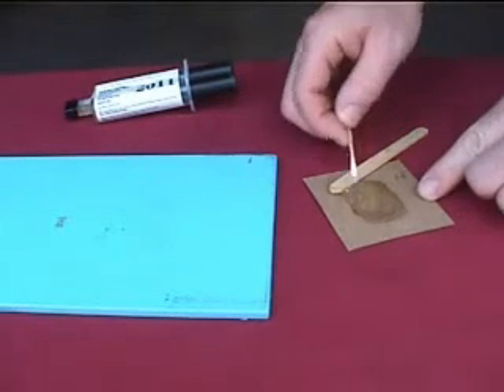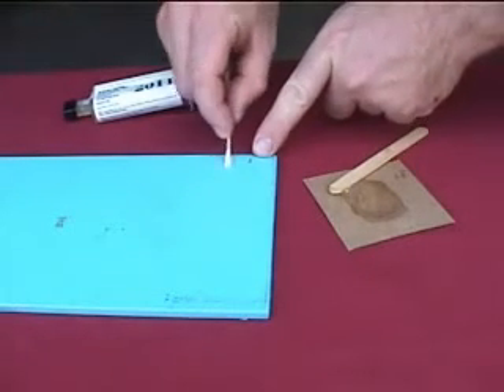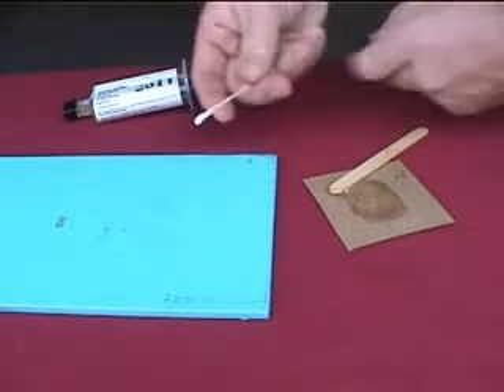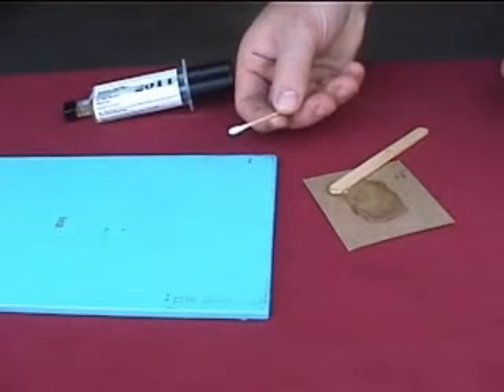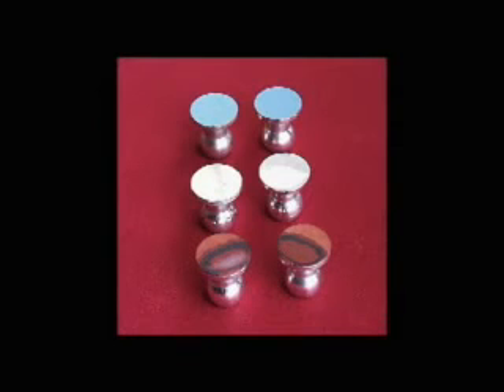With any adhesive selection, it is important to test and ensure that the adhesive does not react to the coating, resulting in a change in its cohesion properties or bond strength. The goal of any adhesion test is to determine the pressure at which an adhesive between layers or cohesive within a layer failure occurs.